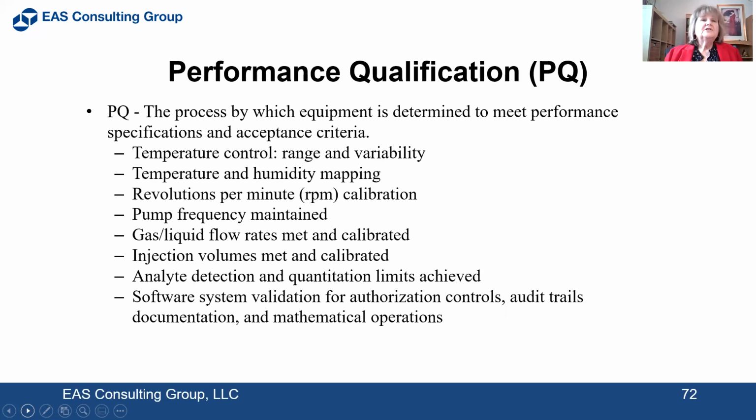You might do temperature and humidity mapping like you would in a stability chamber. You might have to check the revolutions per minute and make sure that that is calibrated, that there is a pump frequency that is maintained, that you have flow rates that are met and calibrated, injection volumes are met and calibrated, that sort of thing.